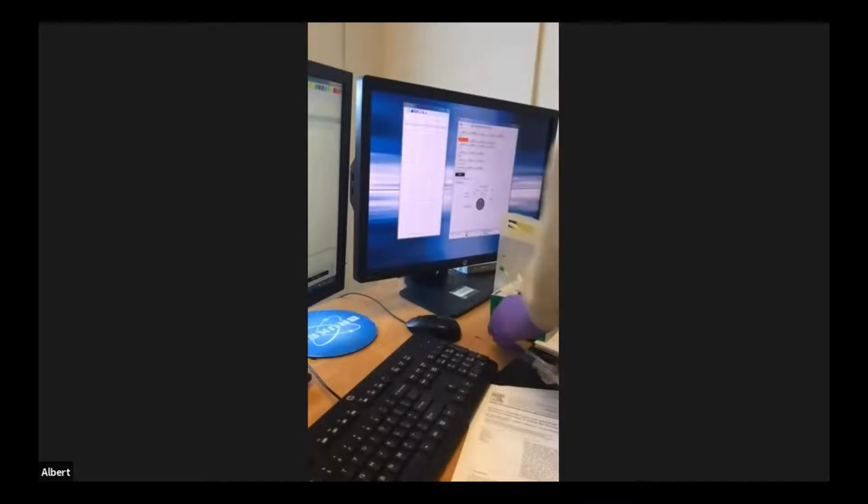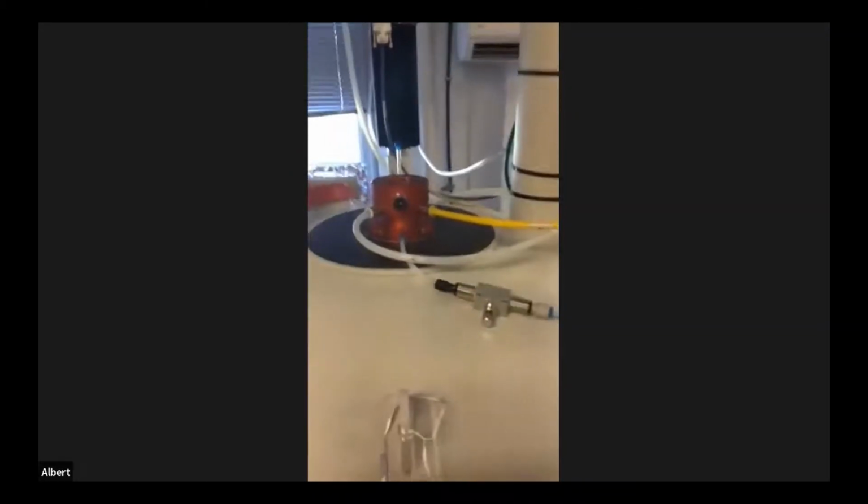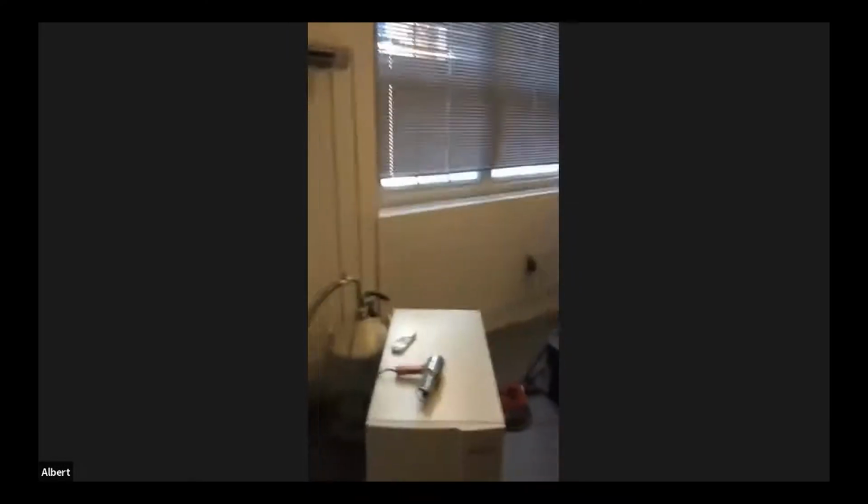This is the depth gauge, so I'm sitting the sample in there. Now I'm ready to put the sample into the spectrometer. I'm gonna come here. I hear that compressed air. So if I sit it there, it's gonna hover like it's supposed to. And now I'm ready to inject the sample into the spectrometer.